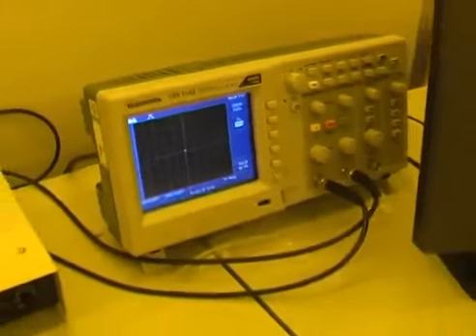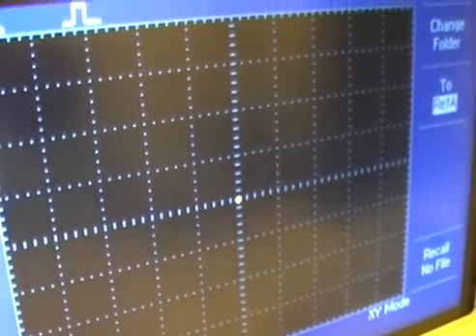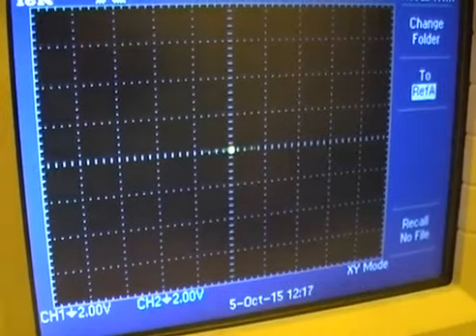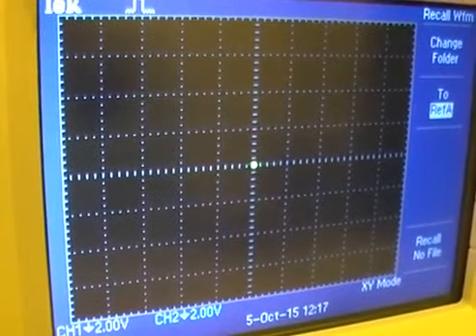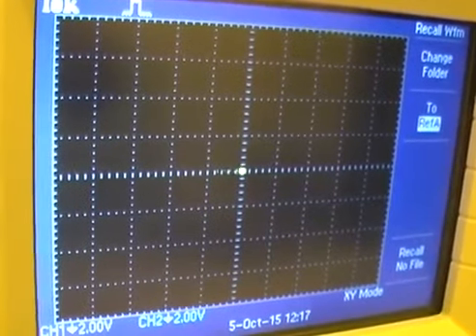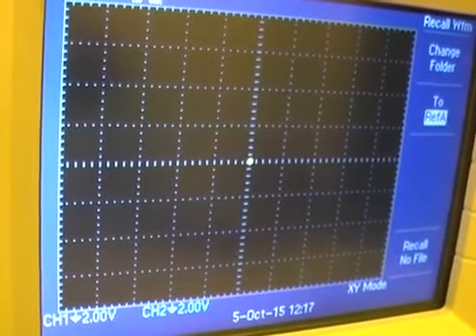Okay, I'll have a pause there. So it's doing some further calibrations now. You can see perhaps it looks a little bit more exciting. Now it's doing some height measurements. And now it's back to STIG calibration, which it does a second time. So lots of calibrations. It takes about 5 minutes to calibrate the beam. And that varies. Some spots are easier to calibrate than others. And the 128 nanoamp beam, which we're using at the moment, is one of the harder ones for it to calibrate. It's right at the edge of its working window.